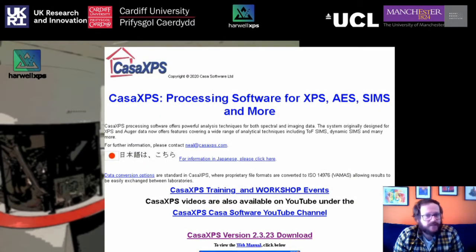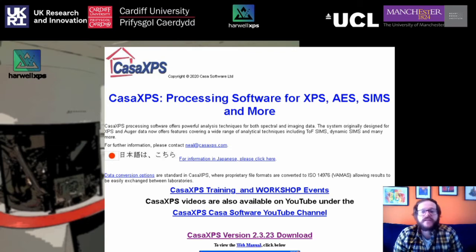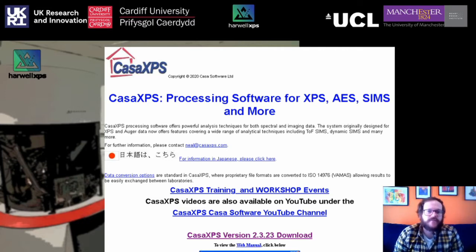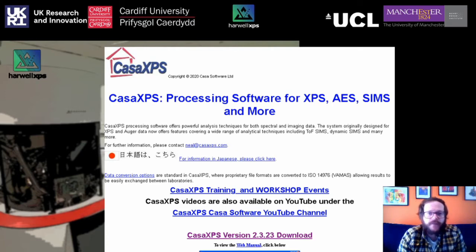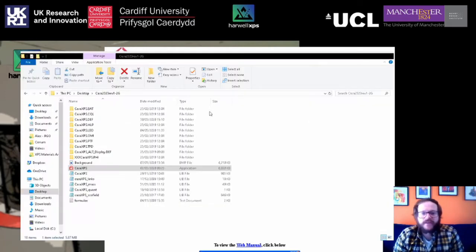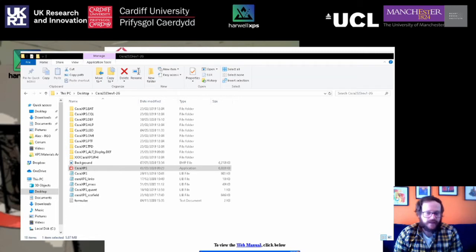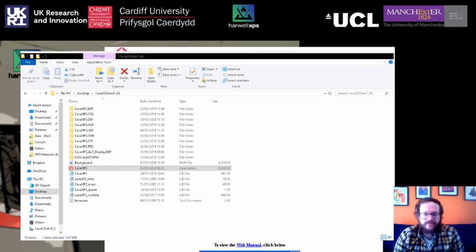Head to casaxps.com where you will find a download link for the latest version. Here you can see we've got version 2.3.23 ready to download. Give that a click and you will get a zip file downloading. Open that up and find the application program — the .exe file. For the next step you are going to need a site license, so have a chat with your IT team to find out what that is. If you don't have one, don't worry — you can still follow along in demo mode, you just won't be able to export any of the data at the end.